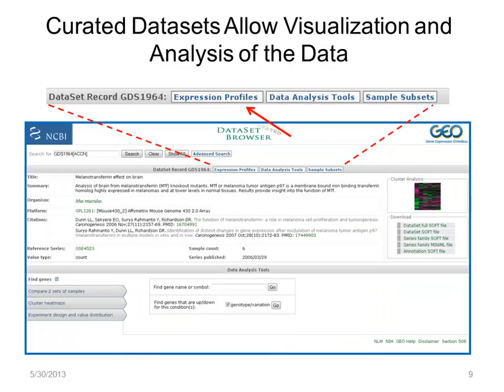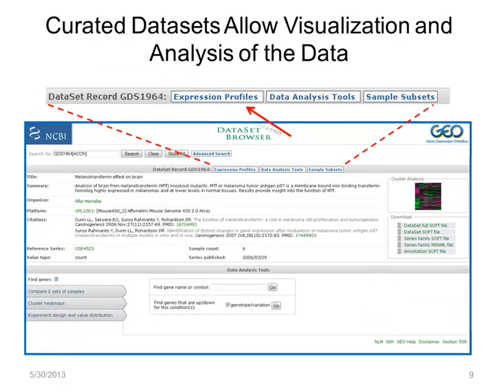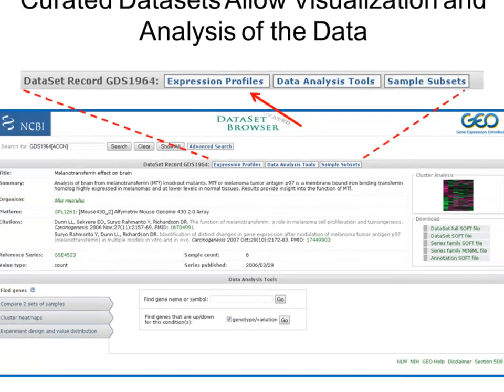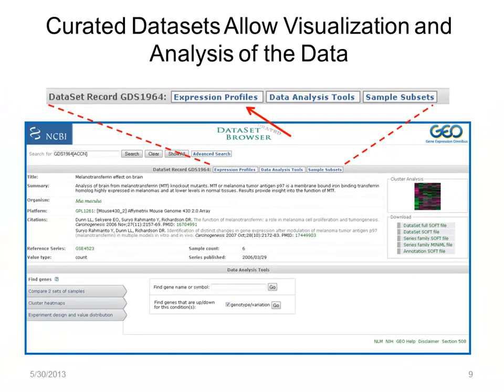Let's look at a GDS record in more detail. This page acts as a sort of dashboard with functions that allow data analysis and download. One function is the Expression Profiles button. Clicking that takes you to the GEO Profiles database, where you can see individual gene profiles.